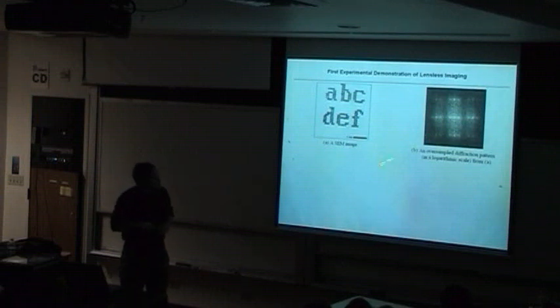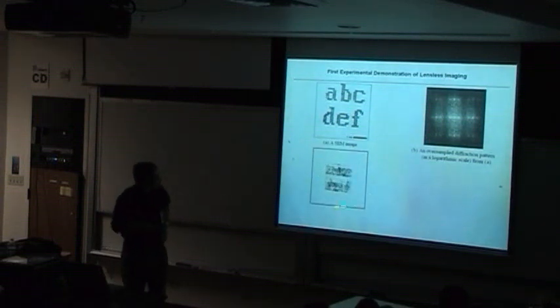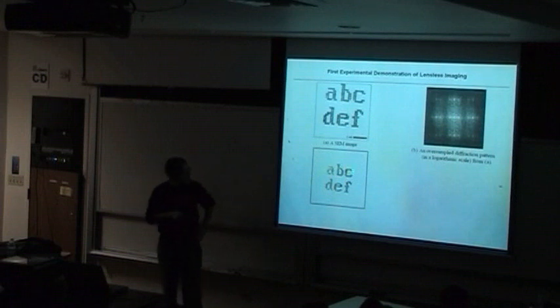And so here I'm going to show the reconstruction. We always start with a random phase angle, and then outside we push it close to 0, and inside we apply positivity constraints. And after a few hundred iterations, we reconstructed this object.